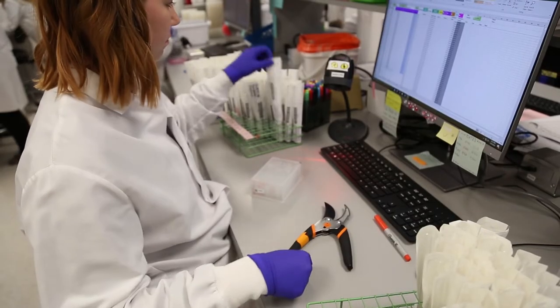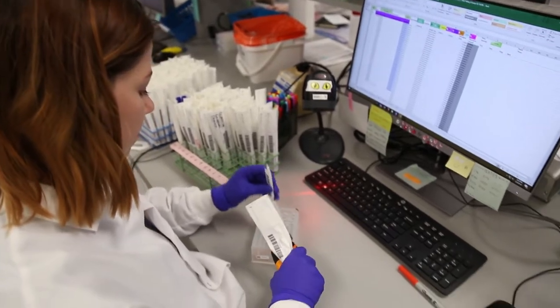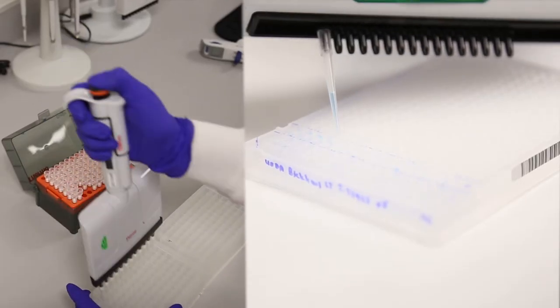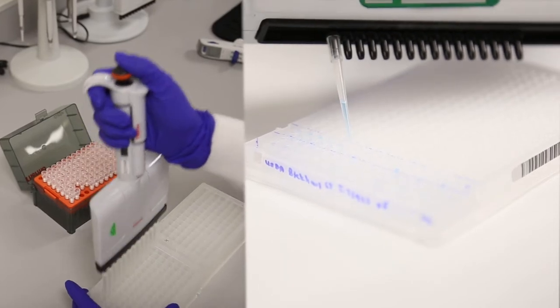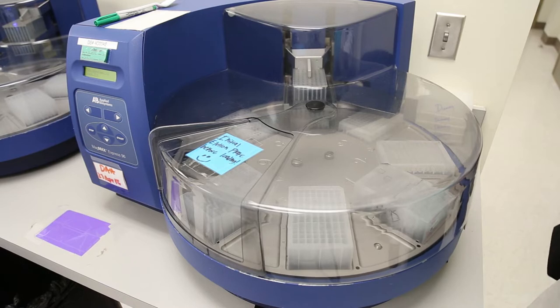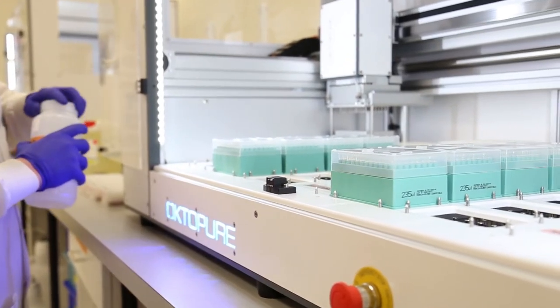To get to the DNA inside the cells, our DNA extraction lab prepares and processes cells from the animal or plant materials. At this stage, we shift from the visible world to work at the molecular level. In DNA extraction, we use chemistry to break down cell walls and free the DNA contained inside the cell nucleus.